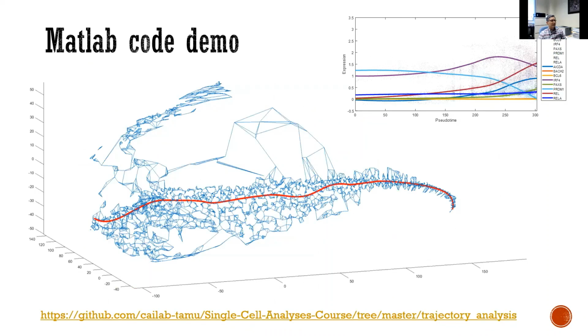Okay, in single-cell RNA-seq data, you can have this tSNE plot, and each point here is a cell, and then you can apply the KNN algorithm to establish such a network between those cells.